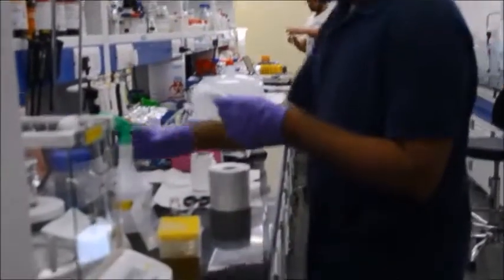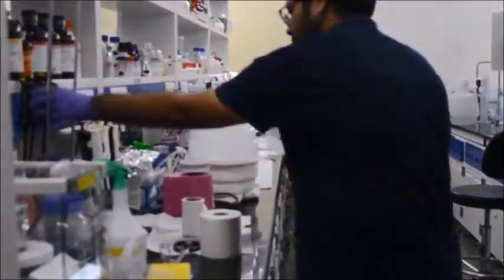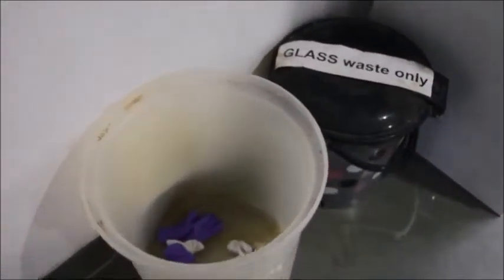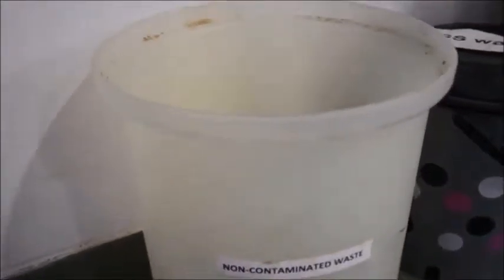As you can see, the student uses the tissue to wipe the article in order to avoid contamination of any sorts, since even the tiniest amount of impurities can cause damage not just to health but also to one's own experiment. In the biological engineering laboratory, three kinds of waste are produced: contaminated waste, non-contaminated waste, and glass waste.